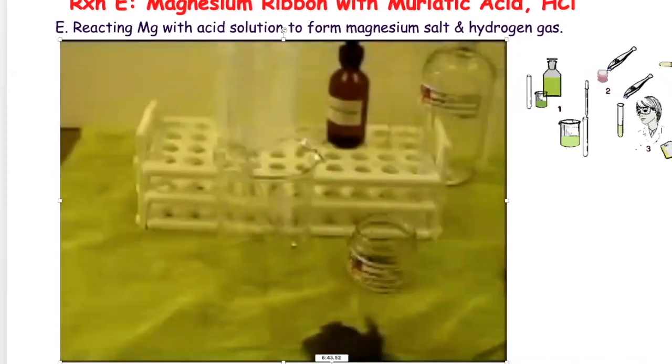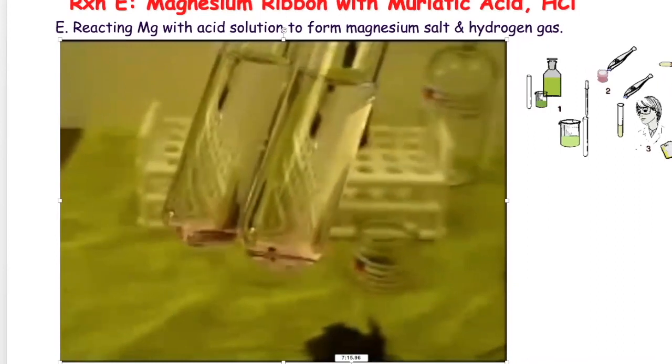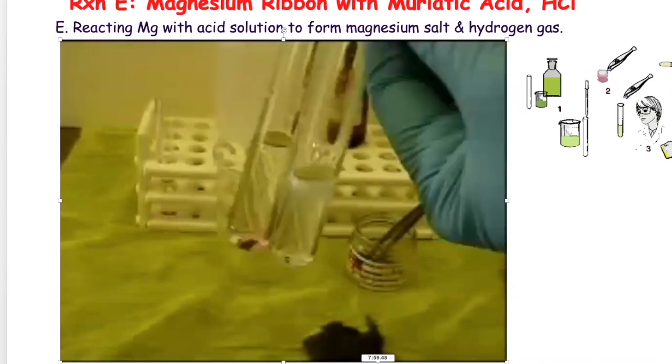So let me fast forward this quick. There. So that's what it looks like.